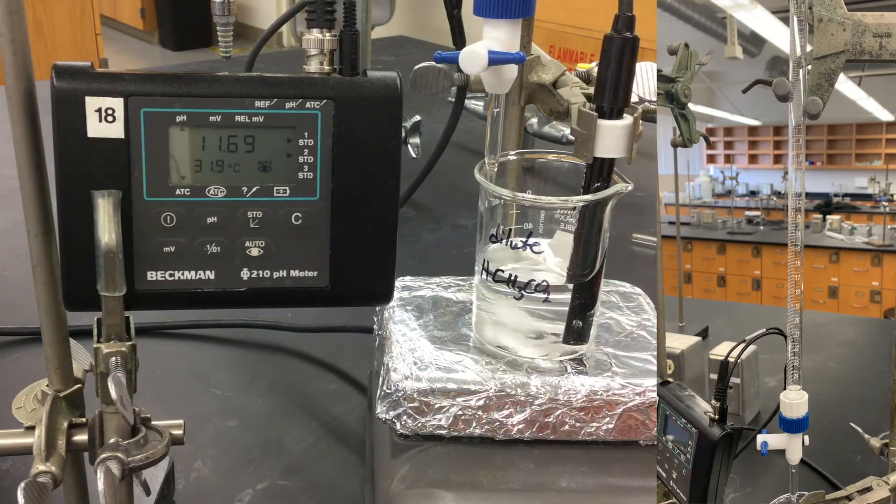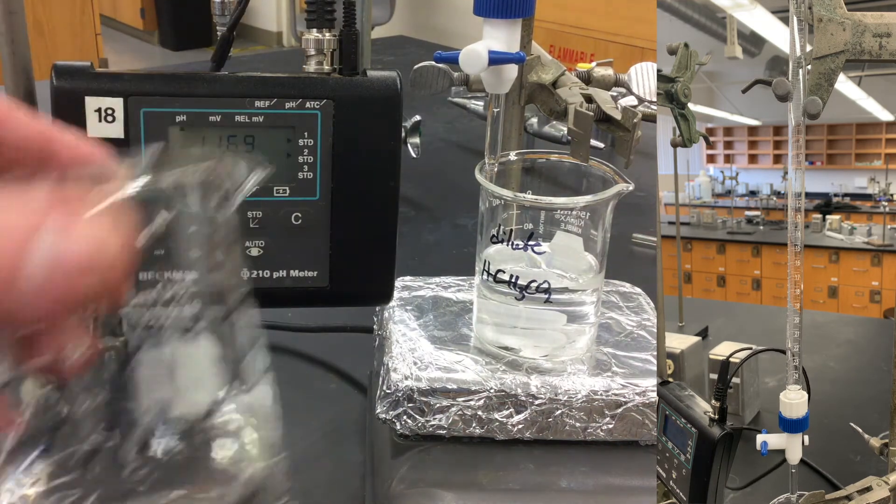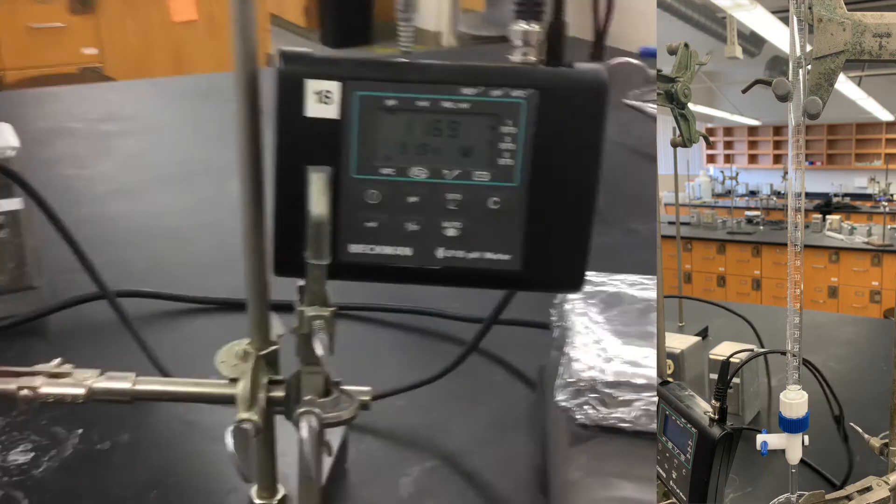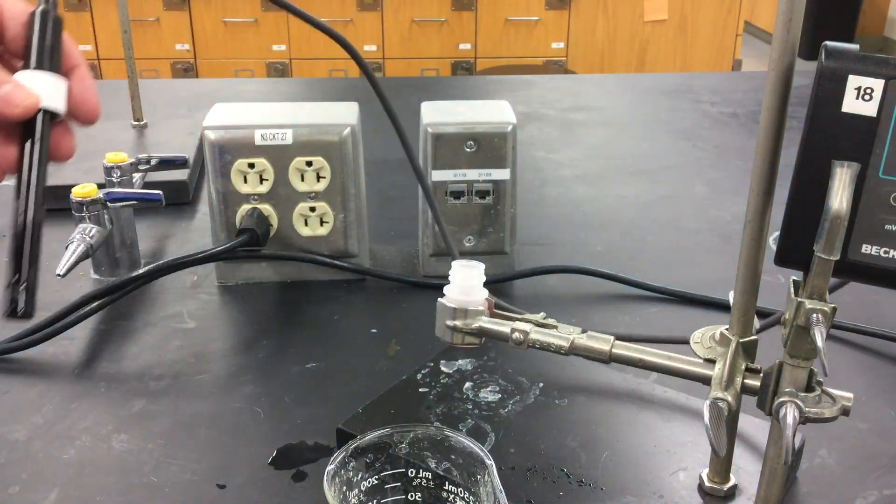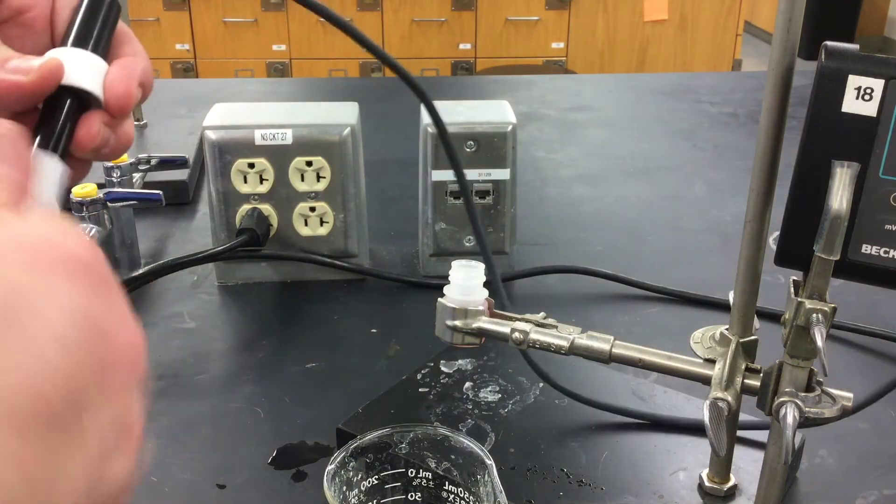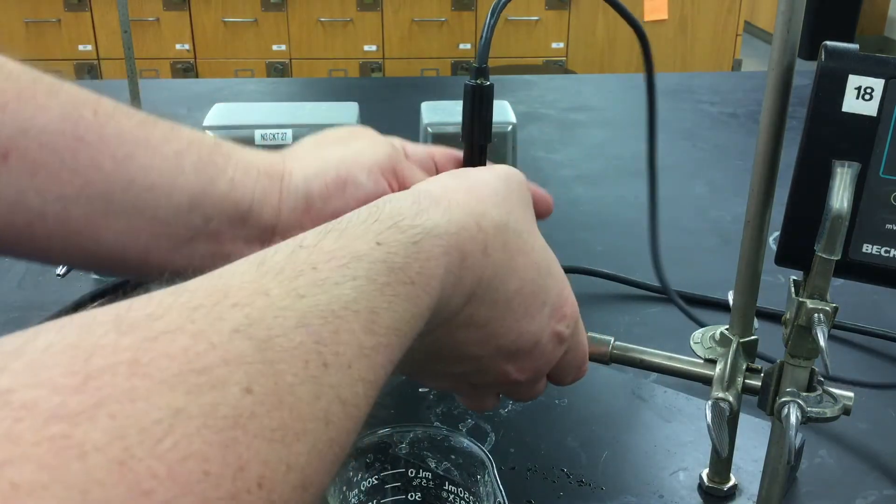Once that is done, we can remove the probe from the actual solution. We can go ahead and grab our waste container and some DI water. Use the DI water to wash it down. Then we can grab a chem wipe and, as always, dry it. And I'm going to store it here in its container while I set up the next part. That's it. We're done.